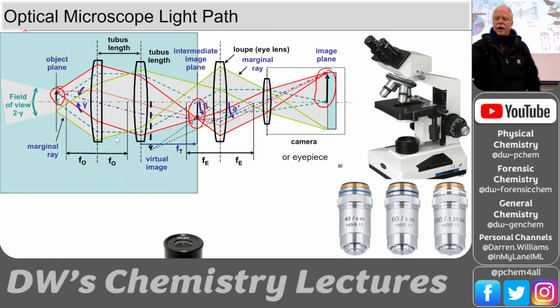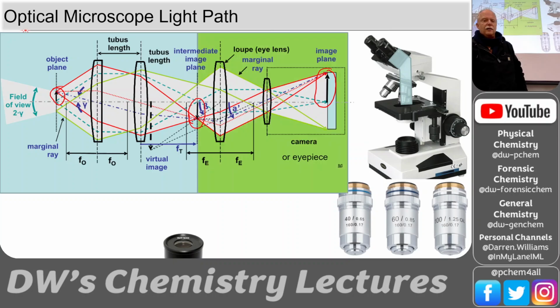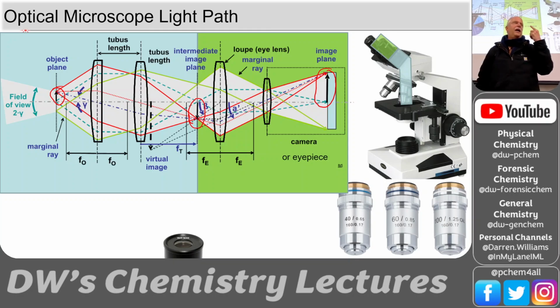And so this blue region is right here in the microscope. That's the bottom part of the microscope, taking into account the object plane, which is down there on the stage, going through the objective's internal optics. There's a little mirror that bends it and sends it to the eye. And then this last part is the green piece, which is the eyepiece. And then the image plane is either your retina or a camera or some other kind of optical capturing device. Okay.